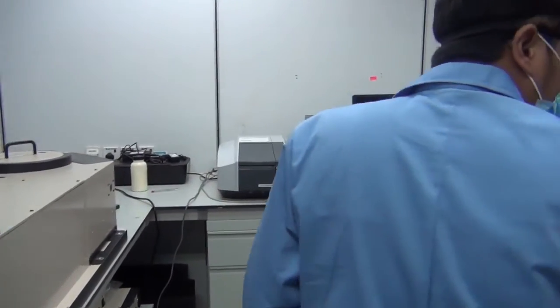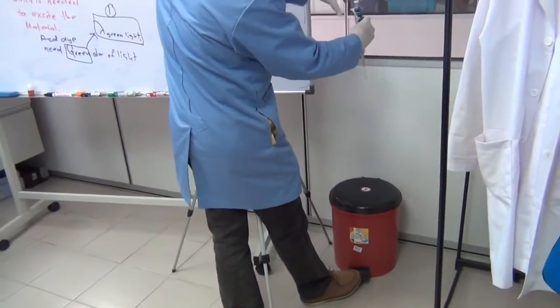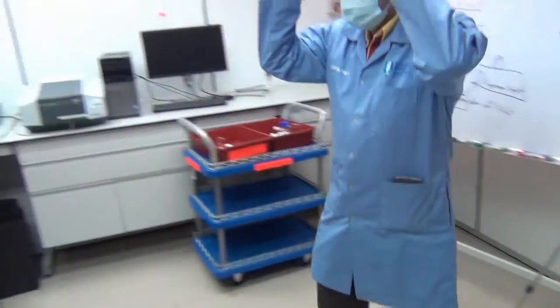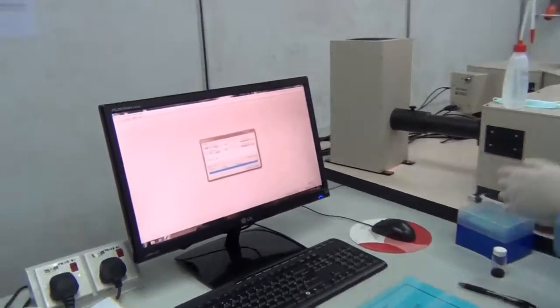So where is the dustbin? Always over here. Waste bucket. Now to release the tip, you need to press this button. Just press it, the tip will go away. That's all. Now the machine is on standby, already in standby mode.